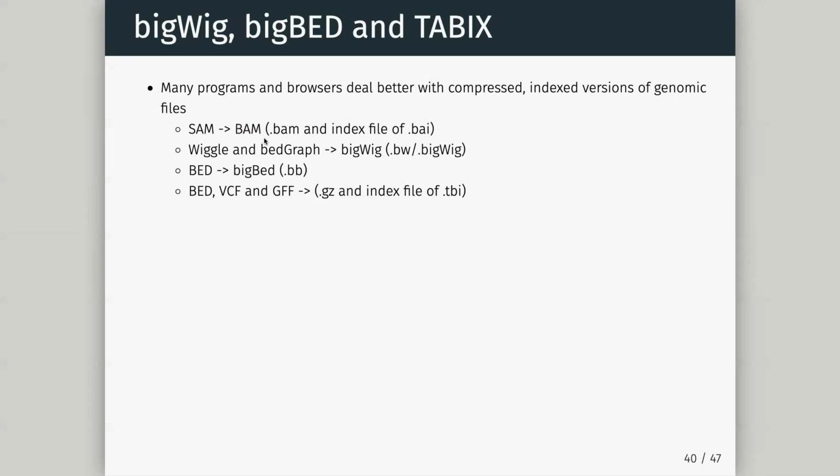I can say, give me the reads from chromosome 10, this position, and it can go look in this BAI file. It knows roughly where to start looking by creating that index, like a real index for a book, and it will go just pull out the reads from that region. And it is millions of times faster than going through the SAM from line 1 until I get to that particular read, that region. So once we've made a BAM file from our SAM file, random access is a lot quicker.